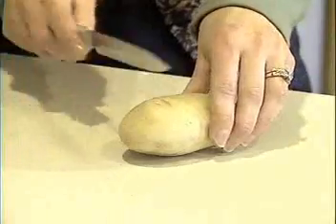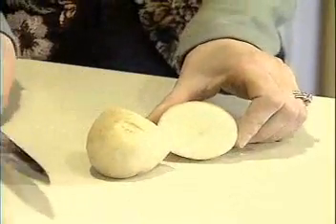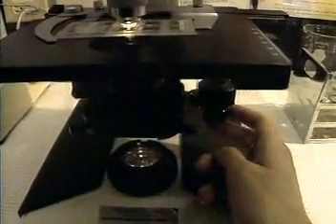Cells are the fundamental units of life. This potato consists of plant cells. This pond water is filled with single-celled organisms. But to be able to understand cells, we have to see them. The development of the microscope has advanced our understanding of cells and of life immeasurably. A lot of medical research takes place at the cellular level.